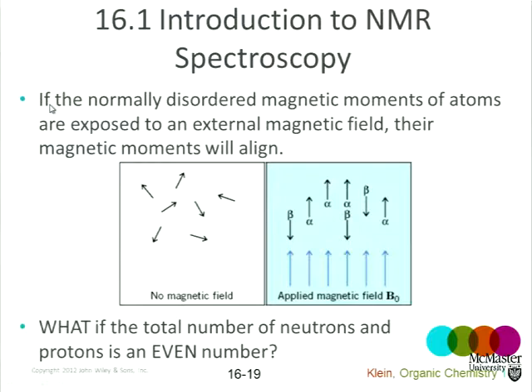If there's a methyl group, it will be at the other end of the spectrum. We'll see one signal for each separate, chemically distinct carbon atom. It's not quite the same as counting the total number of carbons in a molecule because, as we saw, symmetry can sometimes interfere. But what it does give you is a minimal number of carbons from which you can work your way towards a molecular formula. So let's just very quickly finish up here.